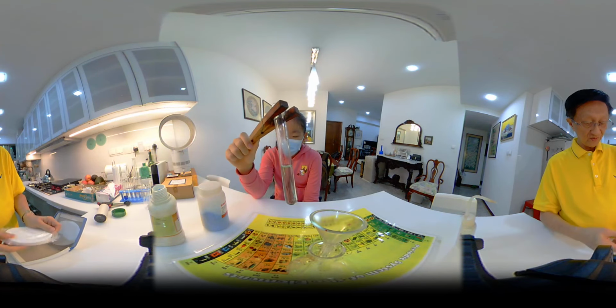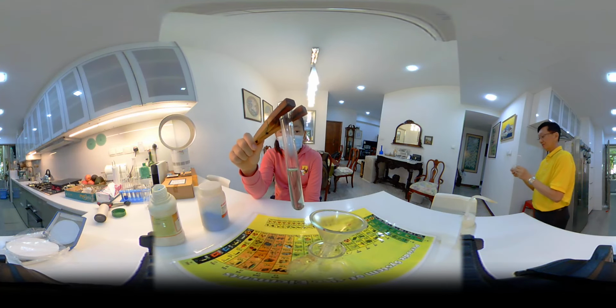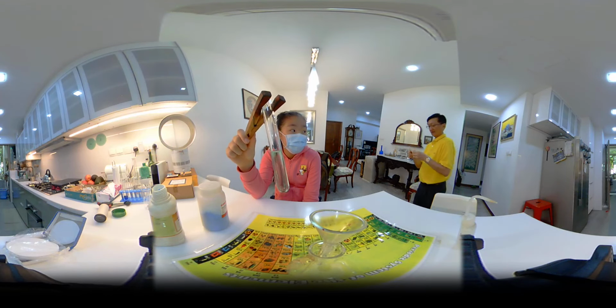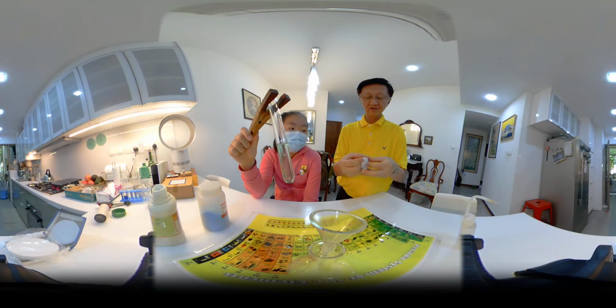We use the filter funnel, and then we use a filter paper and we put it over the filter funnel.